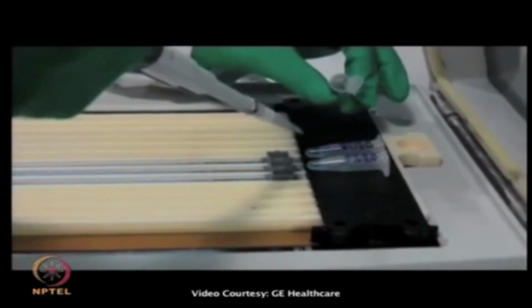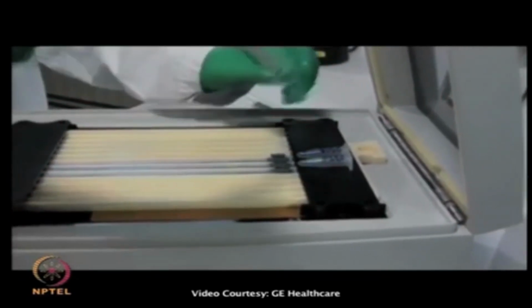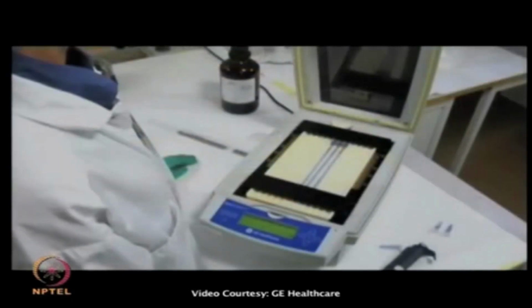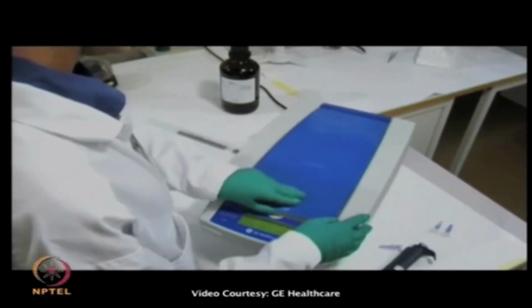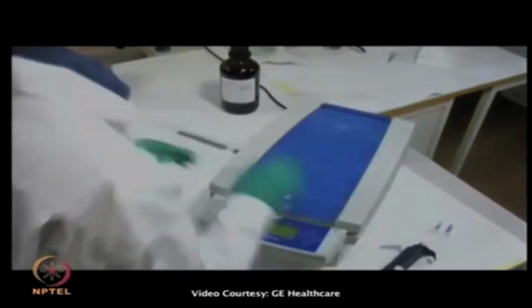We have either directly applied non-fractionated samples without prior fractionation or fractionated the samples into membrane and cytosolic fractions before they were applied. The lid is closed to protect the fluorescent samples from light. The instrument was programmed according to recommendation and run overnight.